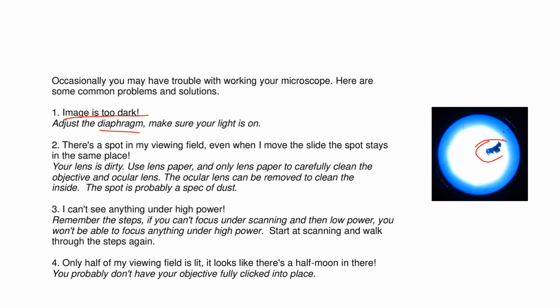they're not what you want to look for. The number 3, I can't see anything under high power. And I mentioned before, if you can't focus under the scanning or lower powers, then you're not going to be able to see anything under high power. So make sure you can see everything clearly with each objective before you move on to the next one.